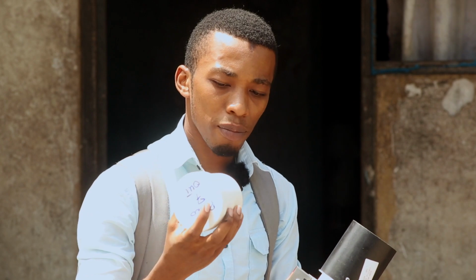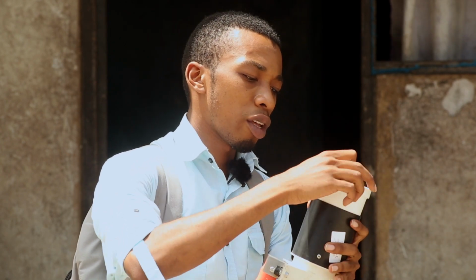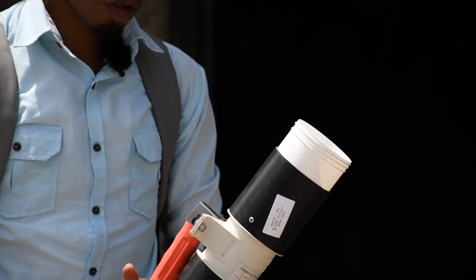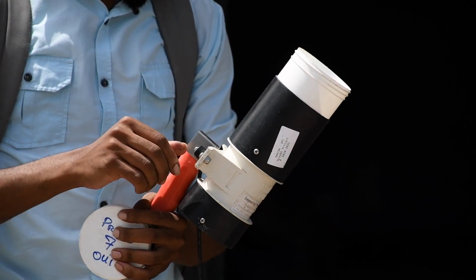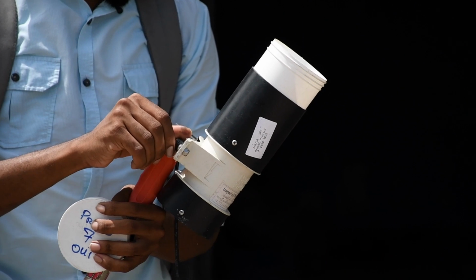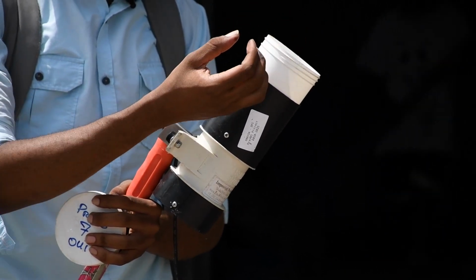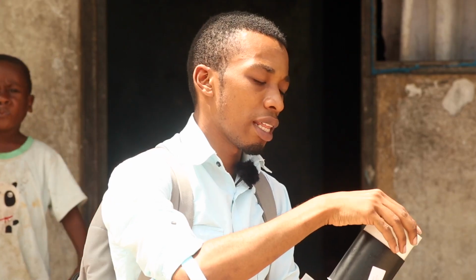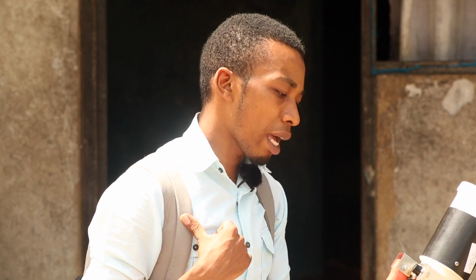We have the cup right here, which we then insert into the aspirator, and then we open it. So once the aspirator is operational, we turn it on by turning the knob right here. You can hear the strong whirring sound indicating the presence of a strong motor that pulls in the mosquitoes and keeps them trapped in the cup, which we then close and then turn off the aspirator. Now, the Procopack aspirator is connected to a powerful 6-volt battery that I carry in my backpack.